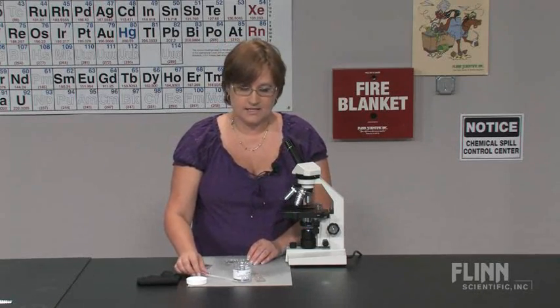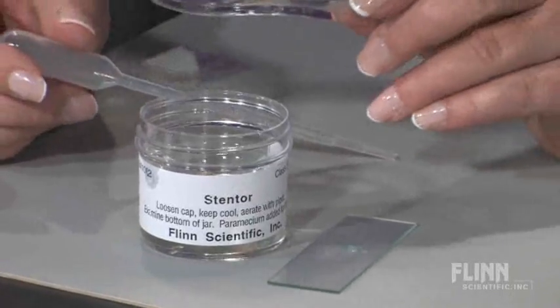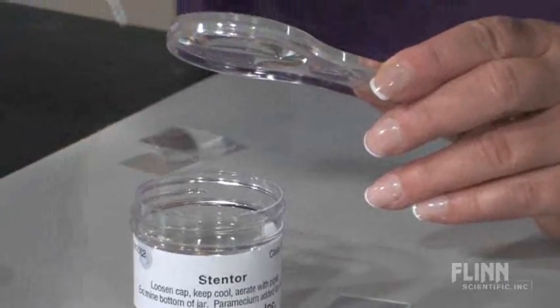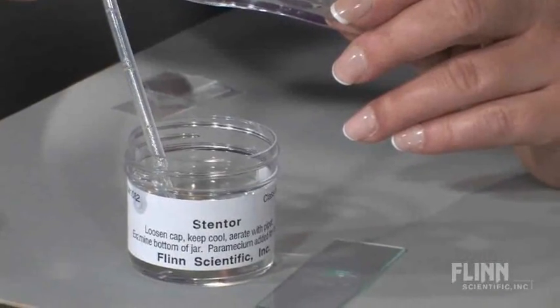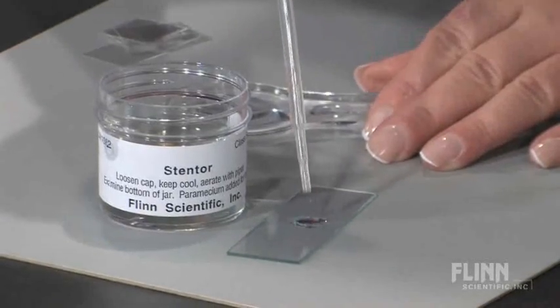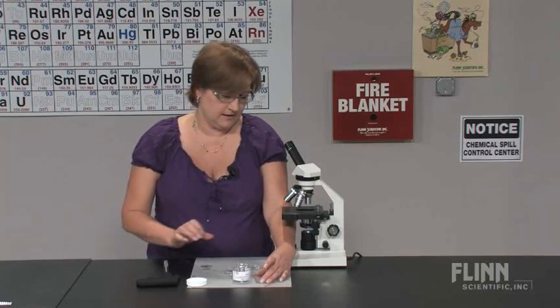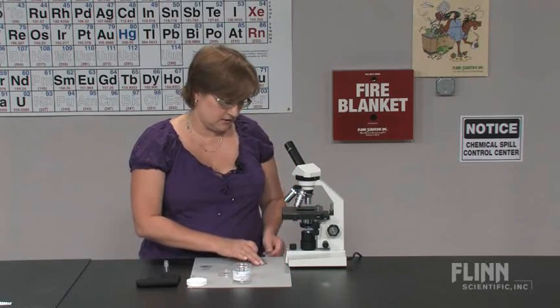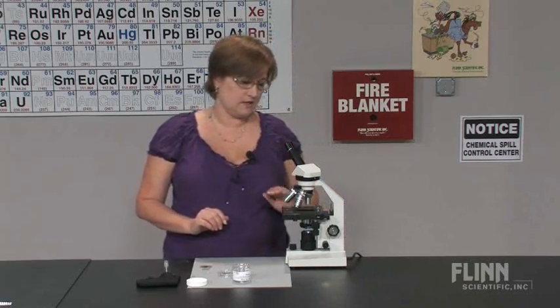Using a hand lens or stereo microscope, focus along the sides and the bottom or around the debris in the culture, looking for a blue-green speck. Use a pipette and gently pull them off of the wall of the culture, and drop them onto a well slide. There's no need to use a cover slip, as a cover slip will inhibit their ability to get oxygen — oxygen will not diffuse into the prepared slide very easily.